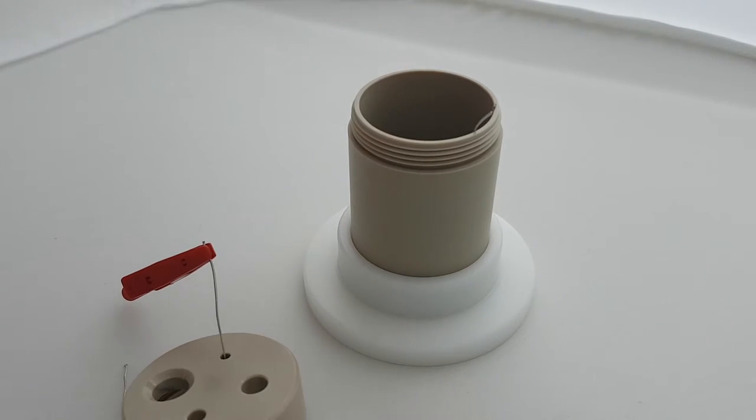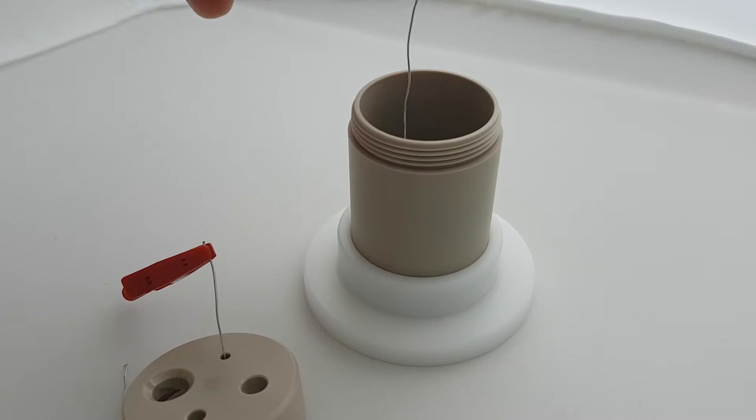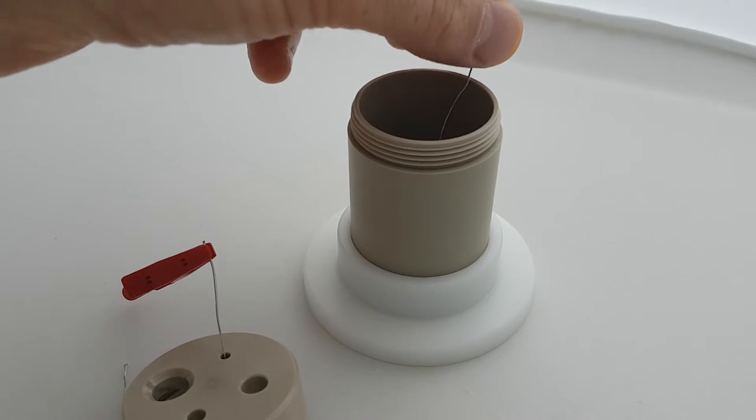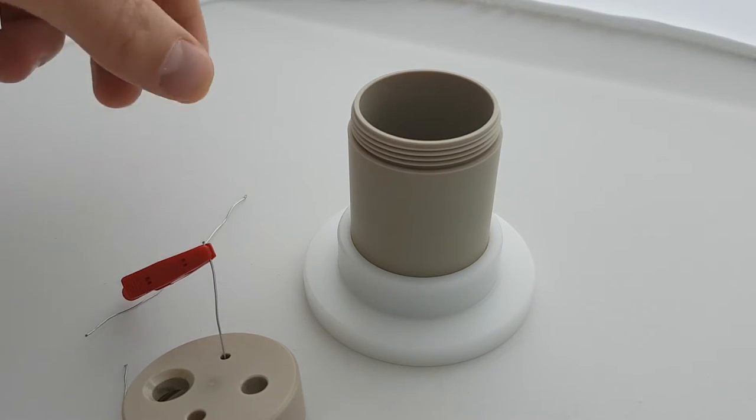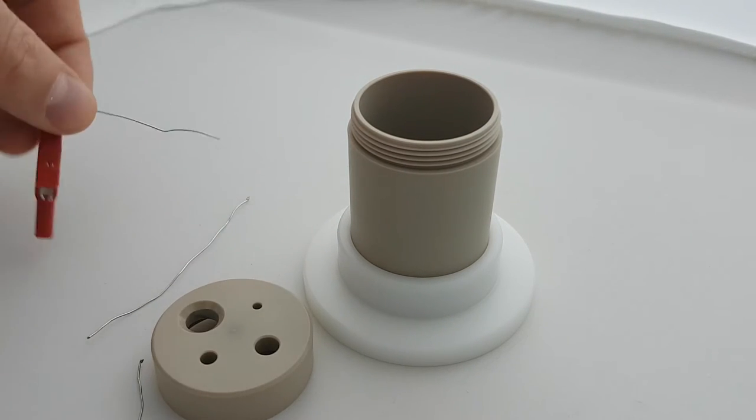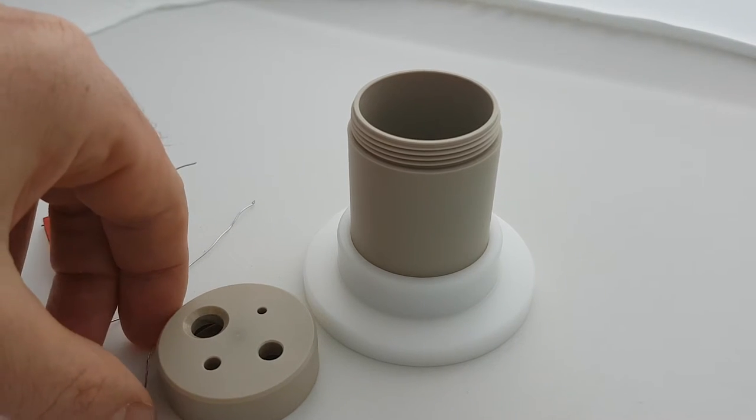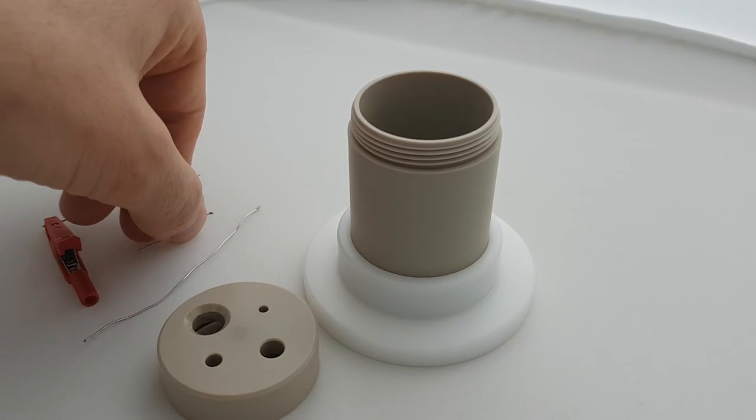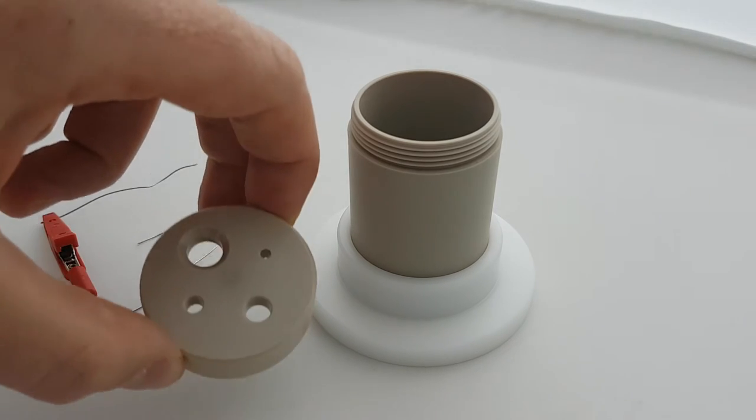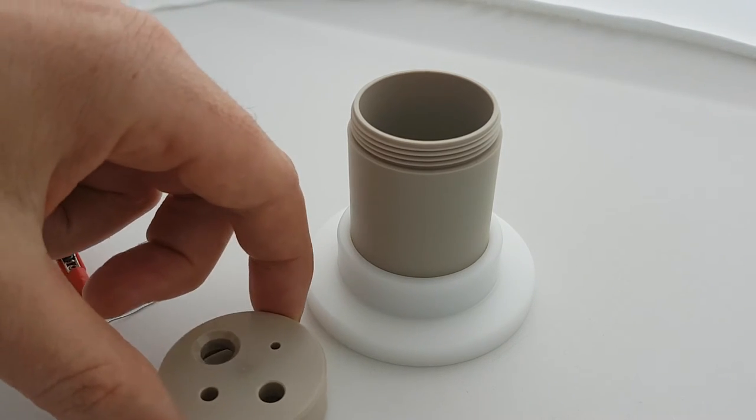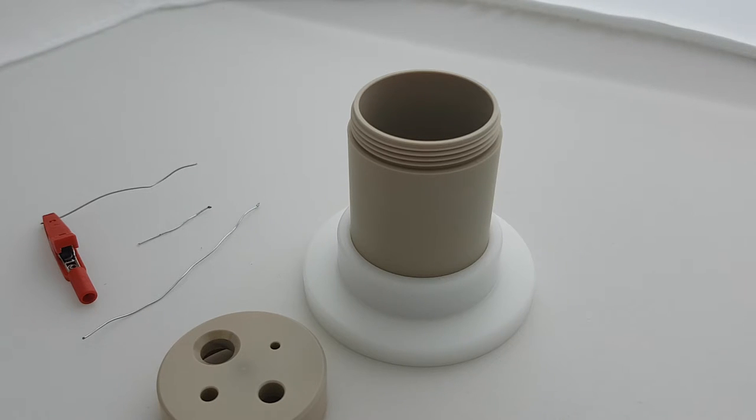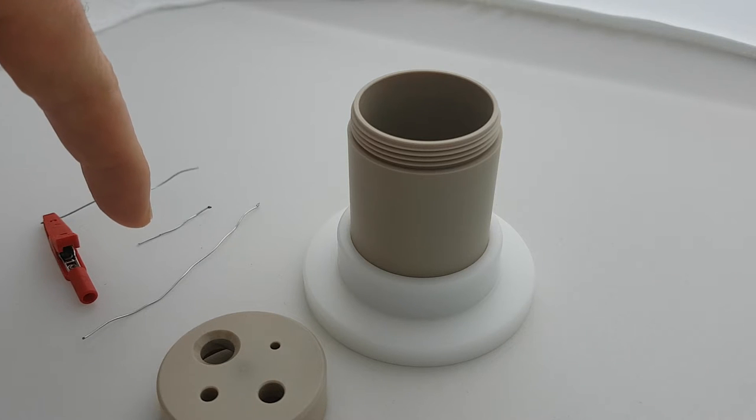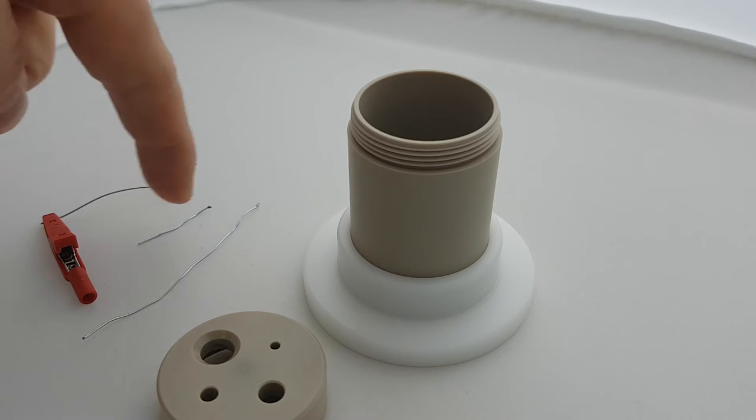If you can get 75mm then that's perfect. So in summary, this is the Electro-Analytical Cell from Zimmer Peacock. I just wanted to try out three lengths of wire through the lid because I imagine people are making their own working electrode and they're kind of dipping it or doing something to it. And that working electrode might be a wire of some description, platinum or gold.